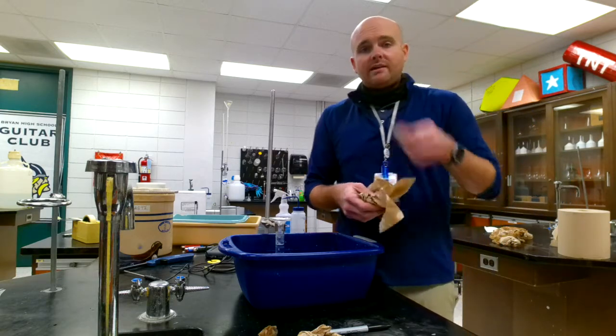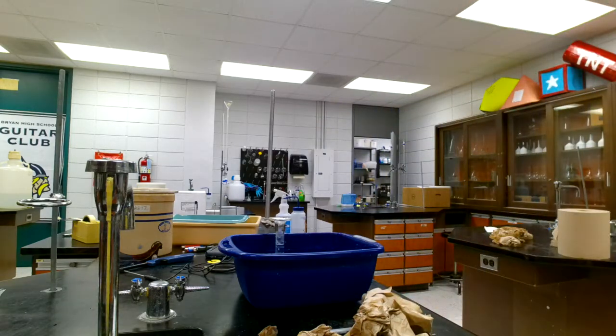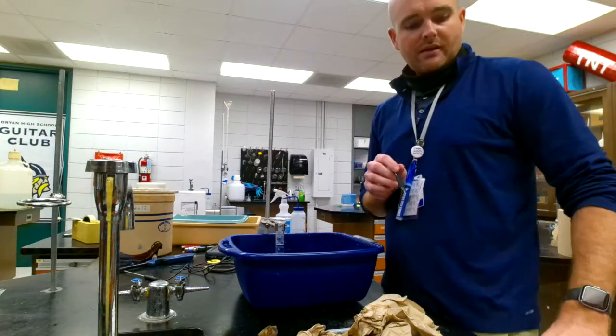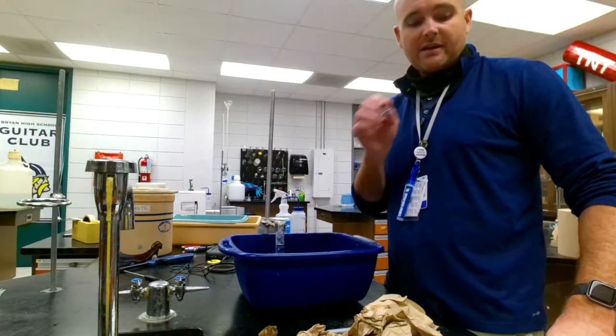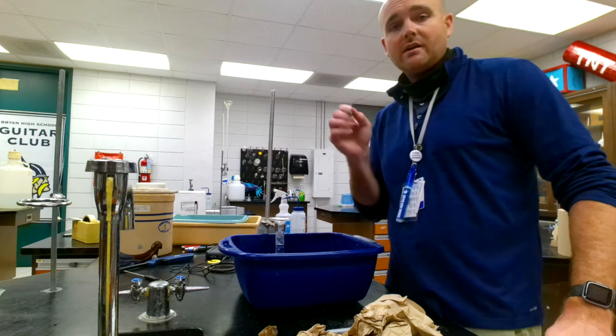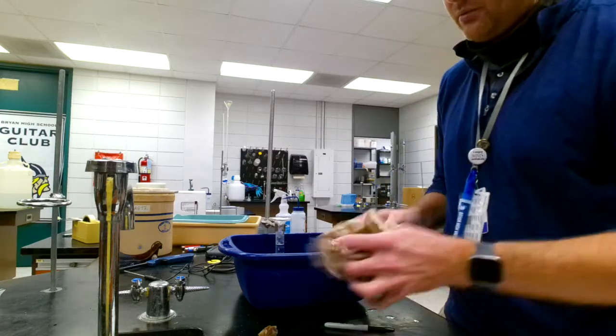So more on IAs later. Let's see if we can check this out. Success. The final mass of that was 21.3581 grams. Good job. So it did decrease. We're in good shape.